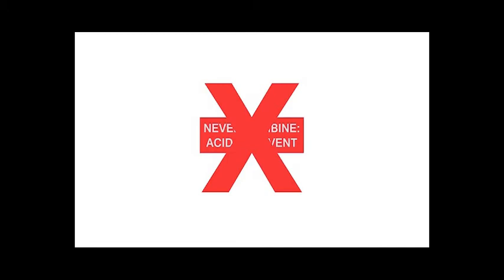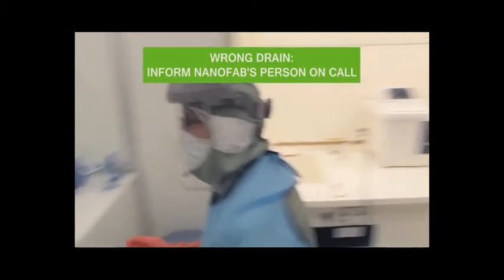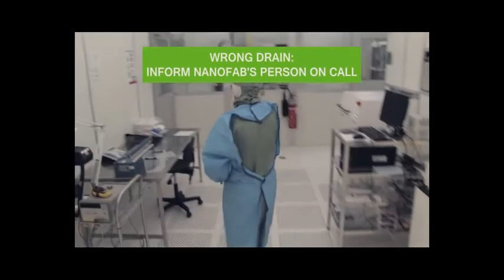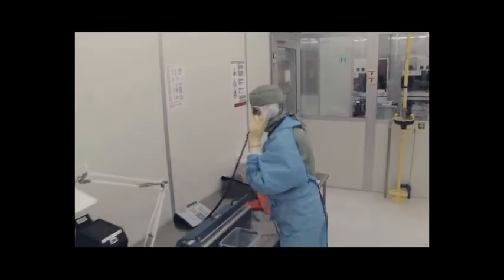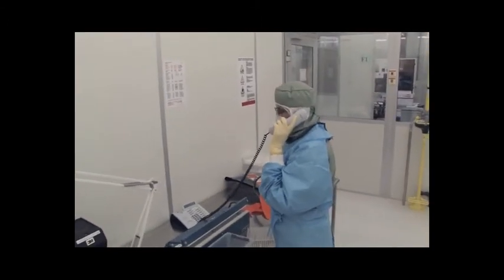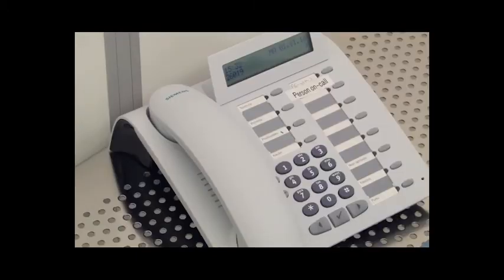Due to risk of explosion, never combine an acid with a solvent. If you accidentally pour solvent into the acid drain or acid into the solvent drain, inform Nanofab's on-call person immediately. The rescue team has a tool for absorbing the solution. Fast action helps you to avoid a possible explosion.